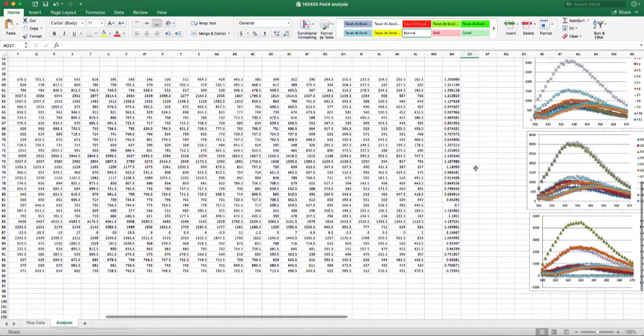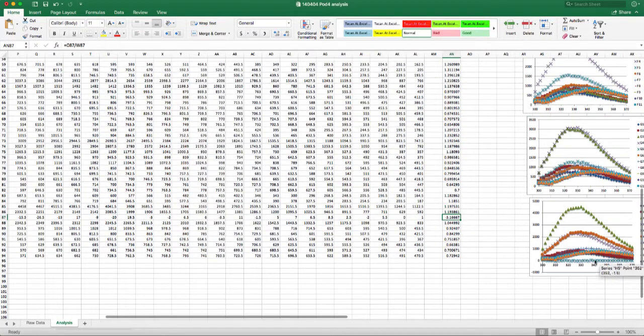Now, one thing you'll notice if we look at this value right here, all of a sudden we have a negative 5.16. And this, it turns out, is this one curve, I should say, that we noticed earlier that does not have a peak. It appears to just be a flat line, probably no protein, right? So this is a point in your process where you should stop, take a look at your raw data and these ratio values. In any case where there appears to be no protein in the well, you should discard that data point. Okay, so I'm going to delete that guy.